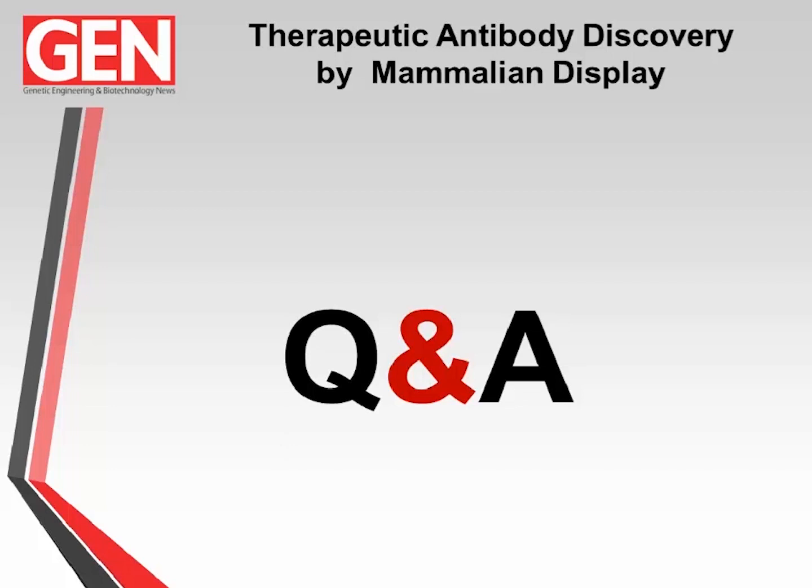And again, because we're working in a flow cytometry system, apart from being able to screen tens of millions of clones in a relatively short time, there is, of course, the opportunity for multi-parametric sorting, so we can screen out cross-reactivities we want or that we don't want, as well as building in these aspects of developability that we spoke about.